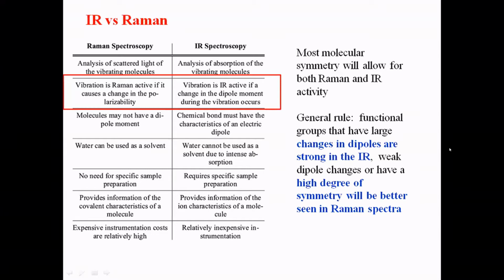So if you feel the molecule is a highly dipolar compound, then you can go for IR instead of Raman. But if the material suffers from symmetry elements, that means atoms or molecules arranged in space, though they have a strong dipole, suffer from a symmetry like center of symmetry or inversion symmetry effects, then you may not get an exact band from IR, because IR is only a single wavelength.